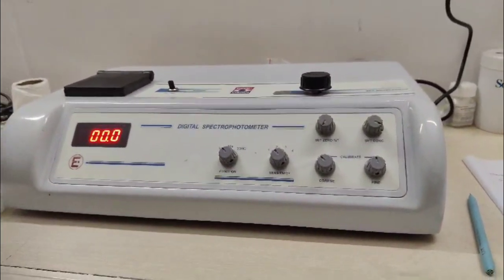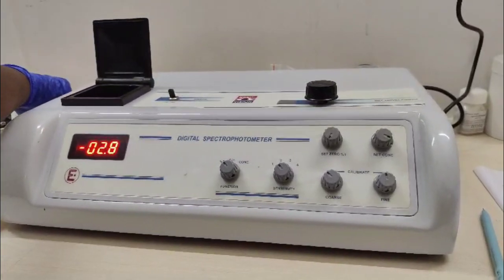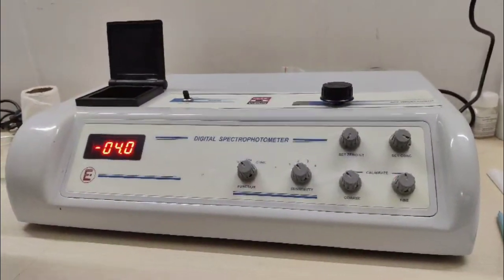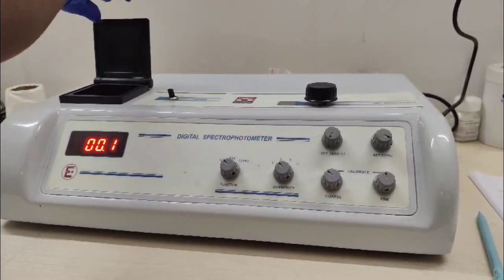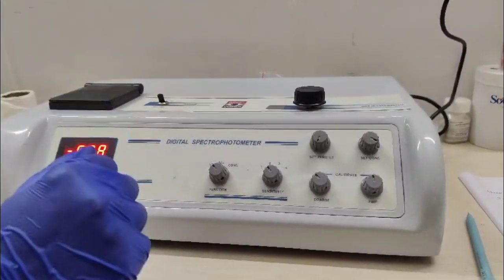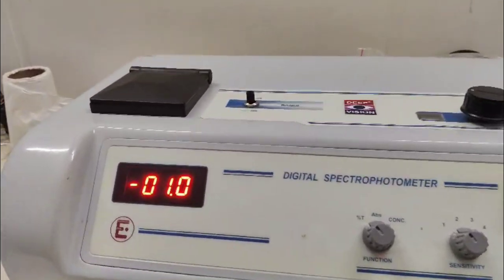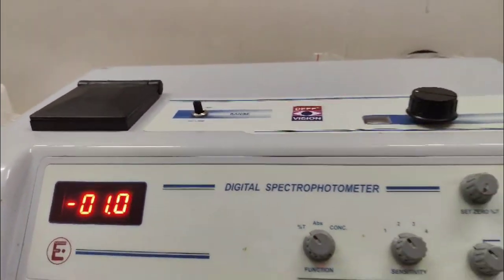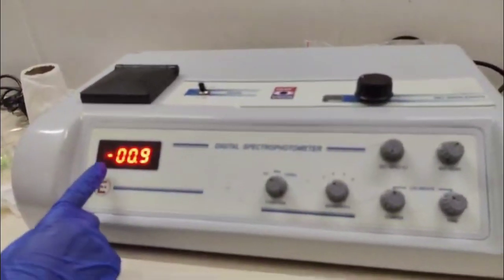Fill the cuvette with S3 solution. Value is 1.0. S3 value is 0.9.